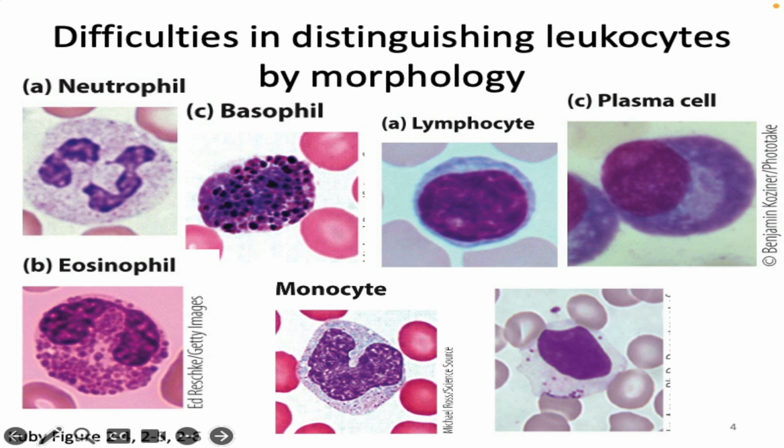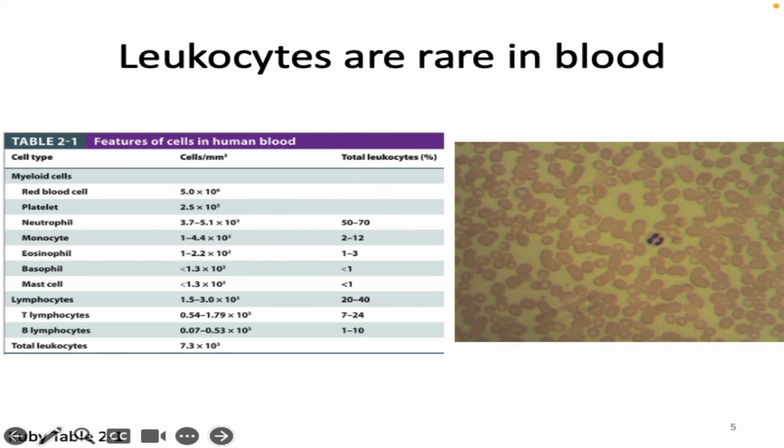So we have some limitations from this process that we talked about. That's not the only limitation, but one limitation is that if I actually looked at blood, white blood cells would be really rare. So I'm looking for needles in haystacks. If I want to take some blood and study leukocytes and all sorts of different cells, it's a needle in a haystack.